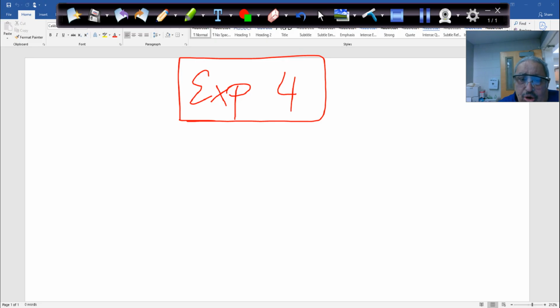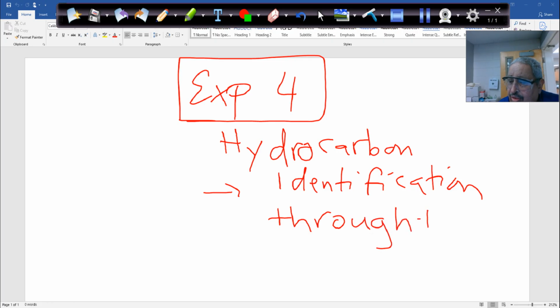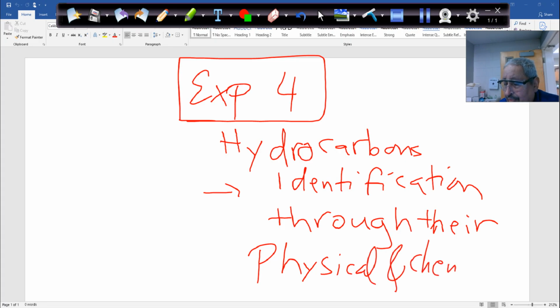So experiment 4, we'll have to look at the hydrocarbons again. Those hydrocarbons will make for them what? Identification. And we'll learn about some of their physical and chemical properties. Correct, guys? Everybody's following?